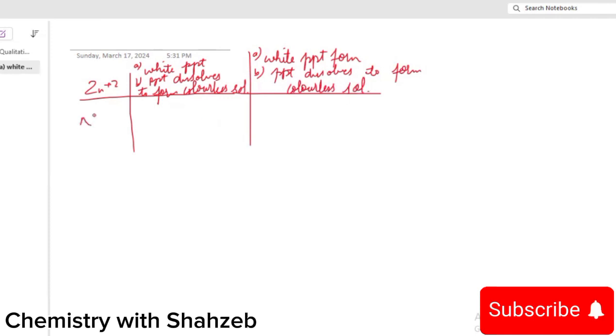Then we have the ammonium ion. In the ammonium ion, what happens? No precipitate forms on addition of a small amount of sodium hydroxide.